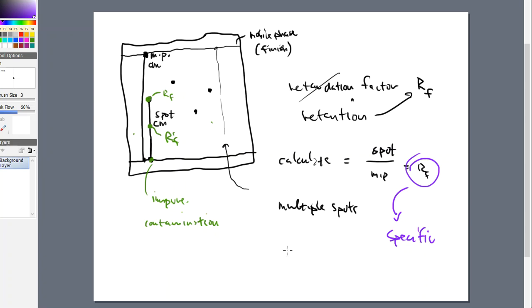In addition to that, keep in mind that hundreds of thousands of chemicals are in existence that are suitable for TLC. Just because one of these goes up to an RF of a certain value does not mean that another one that is very chemically related doesn't go up to the same RF value. If these two compounds have similar characteristics, similar polarity, similar non-polarity, similar functional groups, but they are still different compounds, then they could have the same or similar, close enough RFs that they are indistinguishable from each other in a typical lab that we'll do today. So just keep that in mind. There are tons of different choices out there, and we could have an overlap of RF values for that reason. That's also why we do other tests.